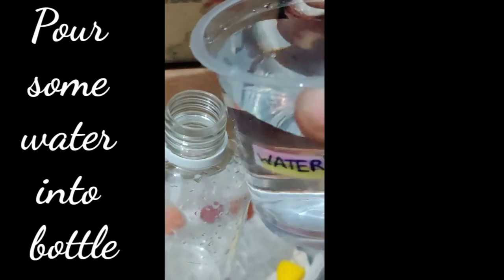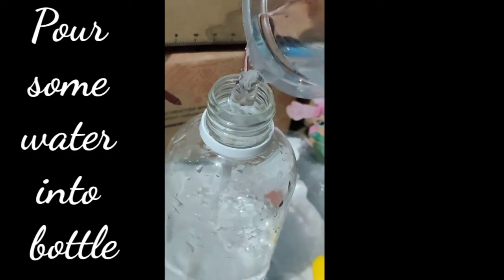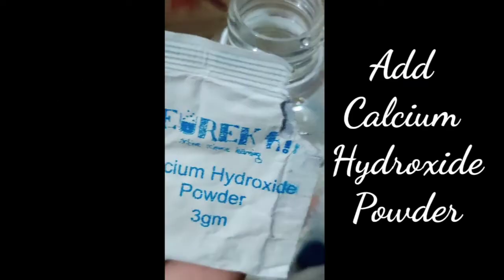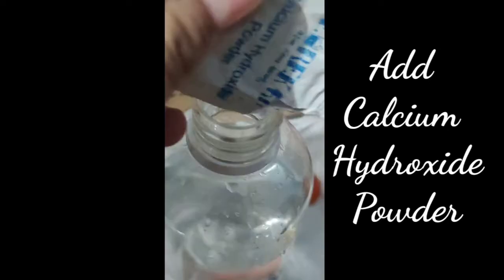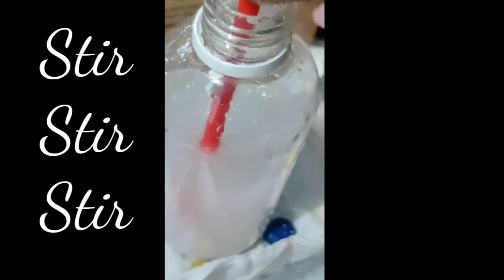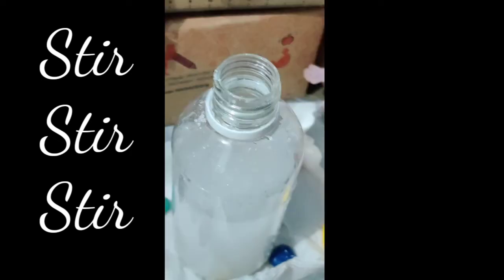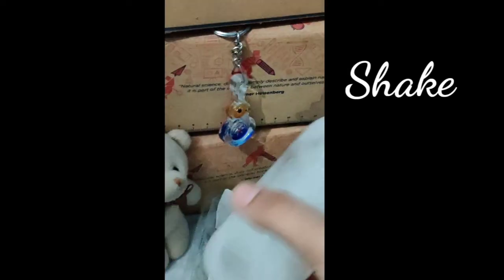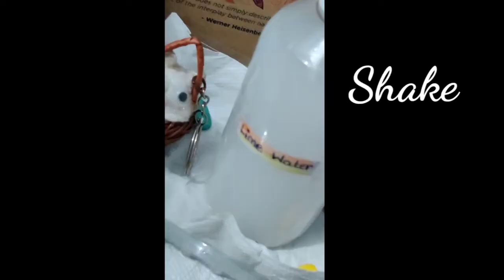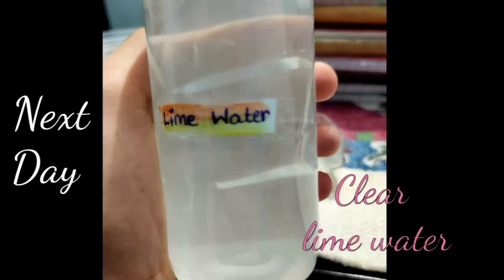Now put some water into the bottle. Add calcium hydroxide. Take a spatula and stir this mixture continuously. After stirring, put the bottle's cap and shake it two to three times. Leave this mixture overnight. In the next morning, you'll find a clear lime water solution.